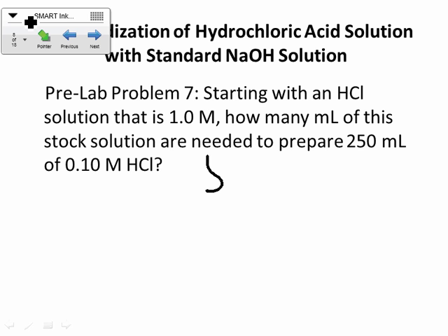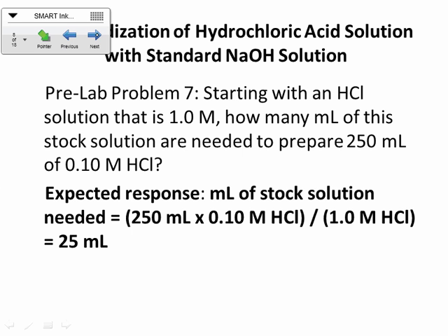Yeah, my great drawings of these. The volumetric flask is what that's called. So if you find a 250 mil volumetric flask, with the one line on it, that would probably be the best thing to use in order to make this solution. Okay, that would be a good place to talk about that.